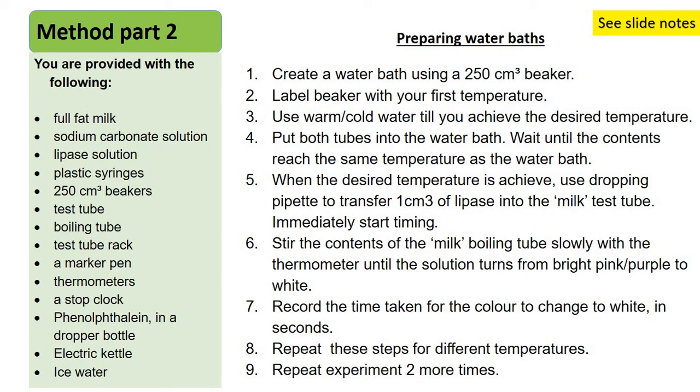When the desired temperature is achieved, using a drop-in pipette, transfer 1 centimetre cubed of lipase into the milk test tube and immediately start the timer. Okay, so once they've reached the desired temperature, whether you're looking at 30 degrees or 40 degrees, that's when you add the lipase to the milk solution and you start that timer.